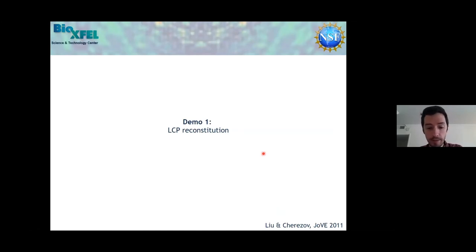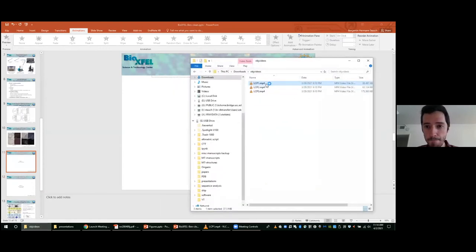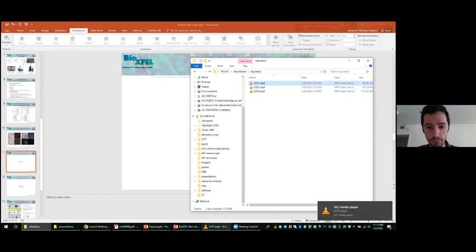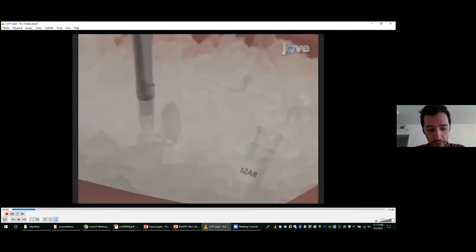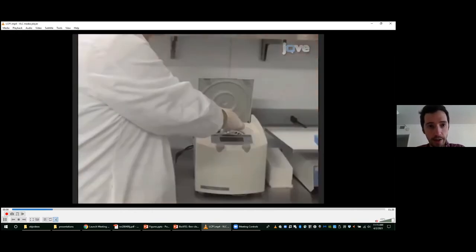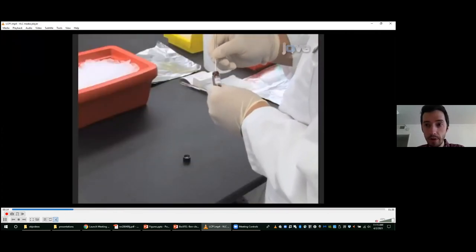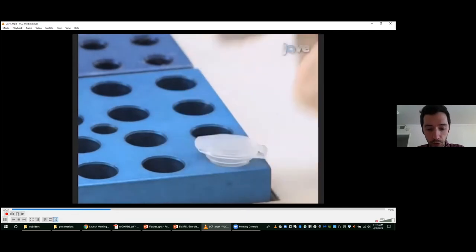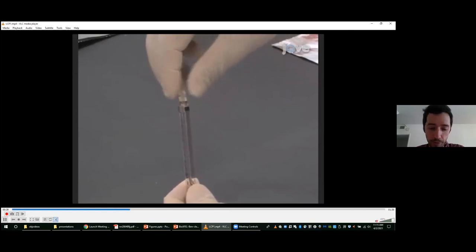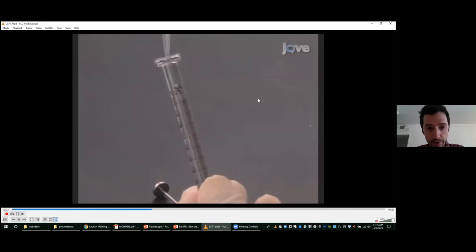I'll now show a quick demo video on how to make LCP. This is from JoVE, Journal of Visual Experiments, from our group. First, the protein of interest is concentrated in a microcentrifuge to the target concentration that we want to achieve or that we can achieve. Then we melt the lipid. For GPCRs we use a mixture of monoolein and cholesterol, and this host lipid is usually prepared much before the experiment.